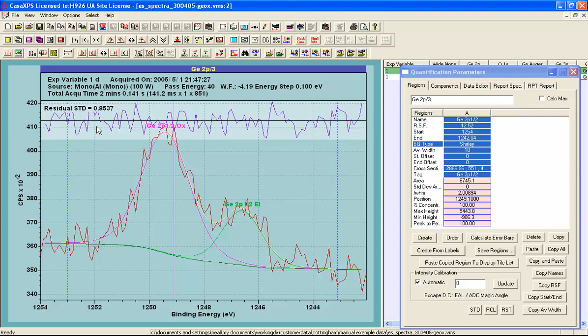The question, however, is, are we really creating quality output by fitting these data using a pair of peaks? In this instance we can answer the question by simply looking at the ability of this background to measure the area of the peak that we are now attempting to fit using a pair of peaks.